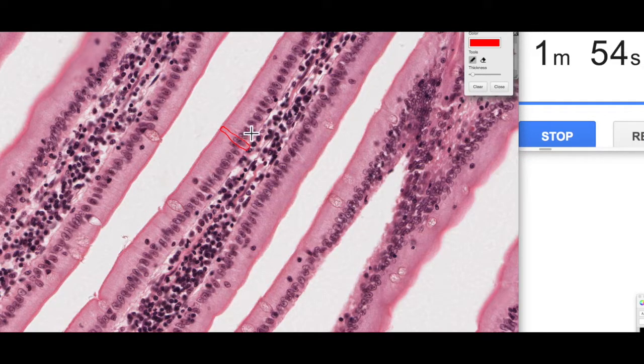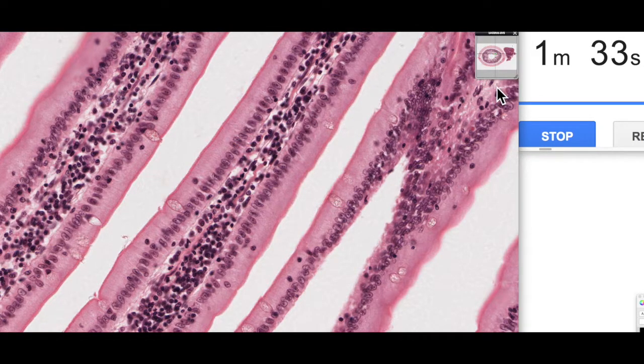You typically get this sort of simple columnar appearance where you want absorption or movement of substances along a surface. So the small intestine, or most of the gastrointestinal tract, is lined by a simple columnar epithelium. And the other area, or the other site where we can actually see a simple columnar epithelium is in the uterine tube.